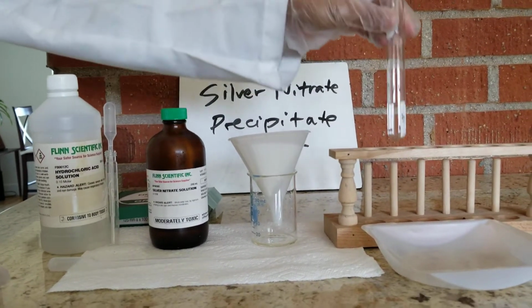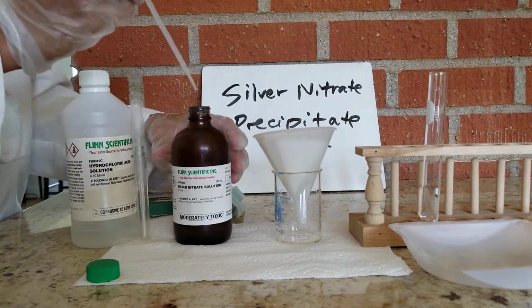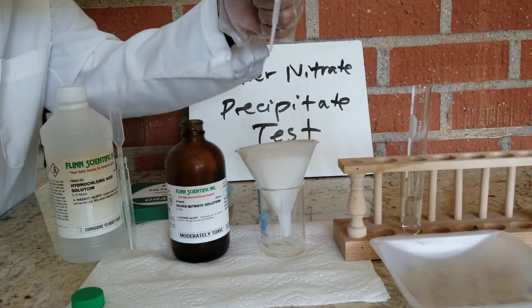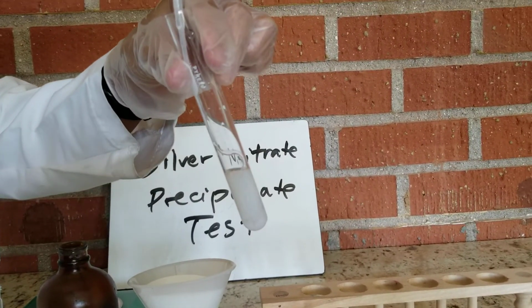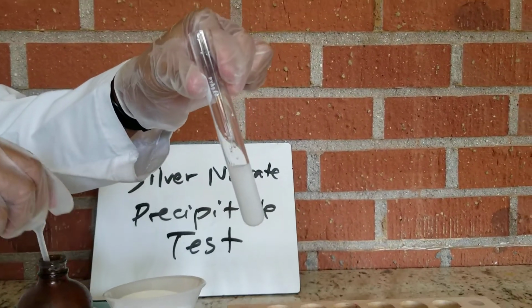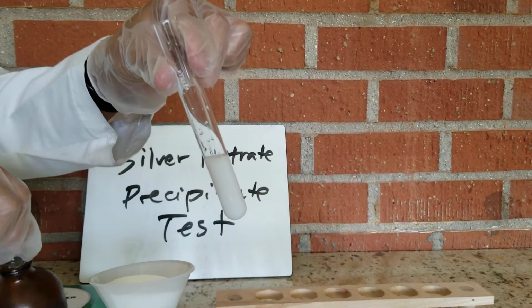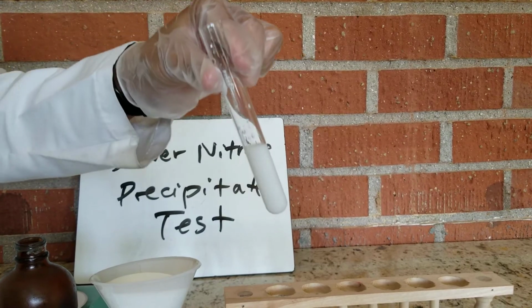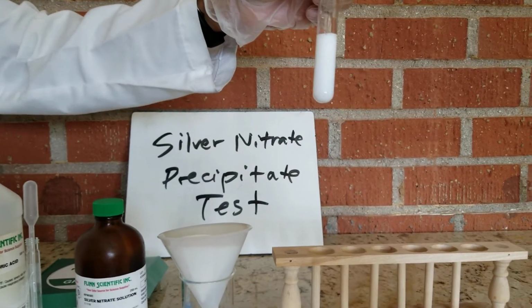Notice it's a clear solution. And then I'm going to add our silver nitrate. So before I add it, notice that the silver nitrate is also pretty clear, but notice what will happen once those two mix together. Definitely showing a change there. Let me add a little bit more. One last milliliter here. Okay. We close our silver nitrate bottle. So as you can see, significantly different from what it was in the beginning.